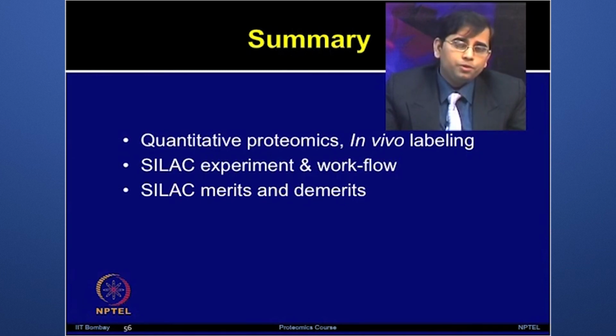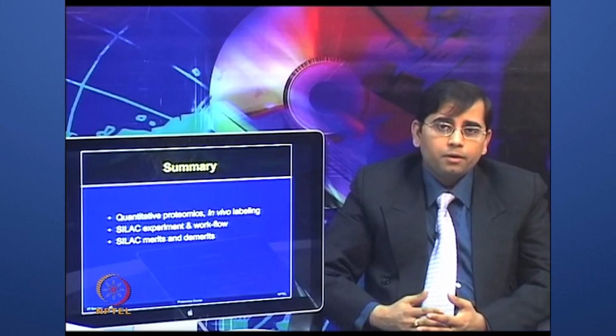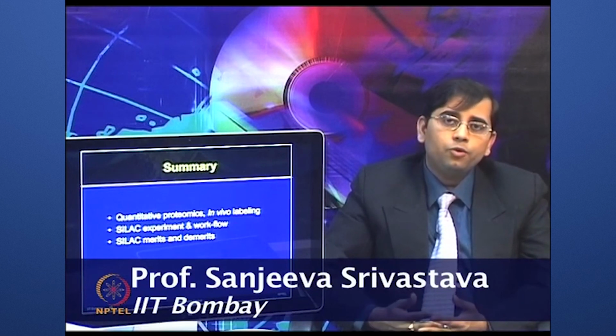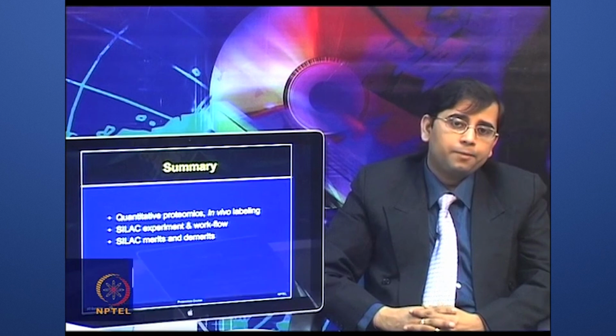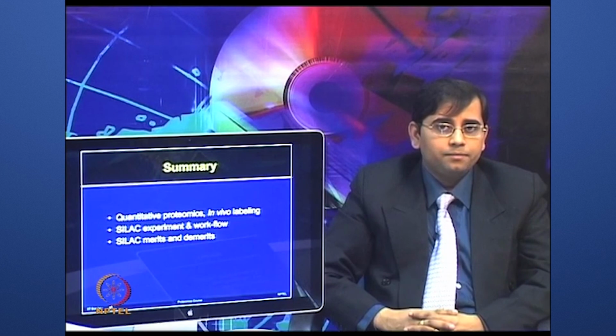The limitations include the use of only cell culture and the metabolic conversion of arginine to proline, but overall SILAC is a very promising technique and its applications are published in several papers. I hope that by today's lecture you are able to appreciate different types of in vivo labeling methods, the SILAC experiment and the stepwise workflow of performing a SILAC experiment, and the merits and demerits of the SILAC method. Thank you.